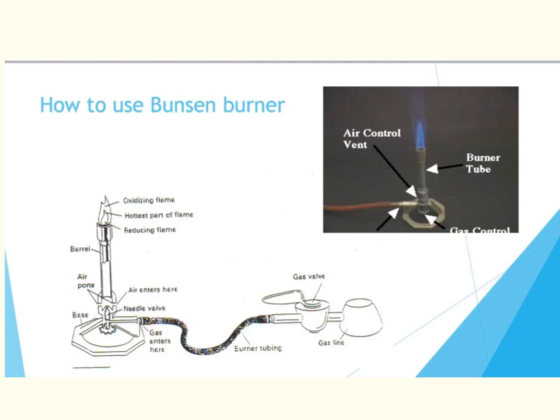The Bunsen burner is the most common piece of equipment we use. Here we have our burner with gas valves that you can turn and adjust. Any valves located along the gas line you should leave alone. You want your burner to burn with a blue flame — blue flames burn cleaner, meaning no soot buildup, and they burn hotter. To light it, turn your gas on and use your striker right over the top. It should light. If you try two to three times and cannot get it to light, turn the gas valve off. Failure to do so causes a large gas bubble to build up, and if you bring fire near a large gas bubble, you will have an explosion. Lab number two uses the Bunsen burner, and then we use them for the rest of the year.